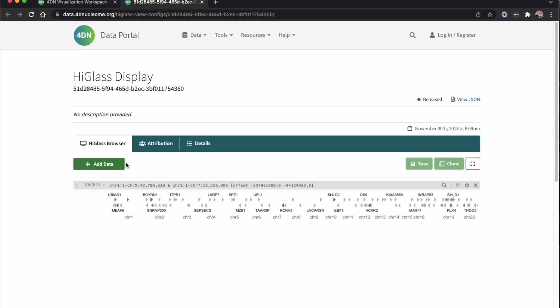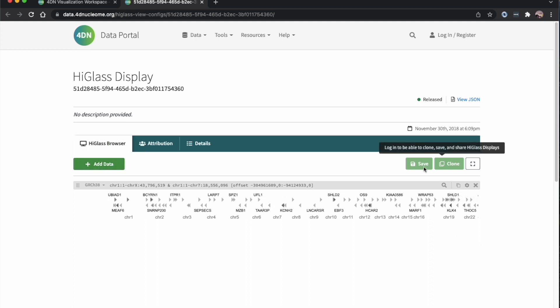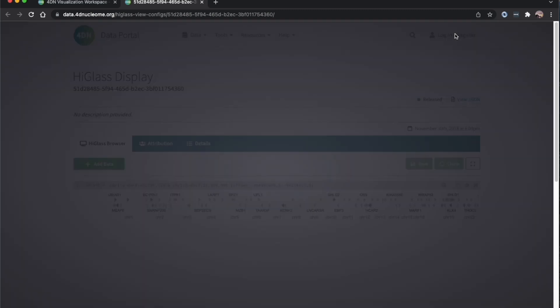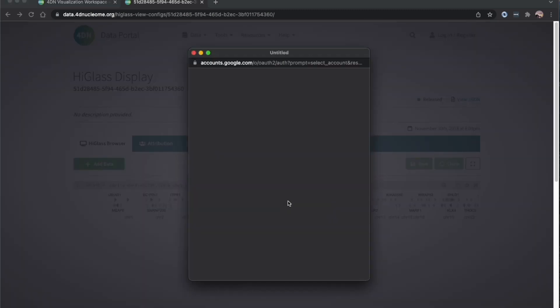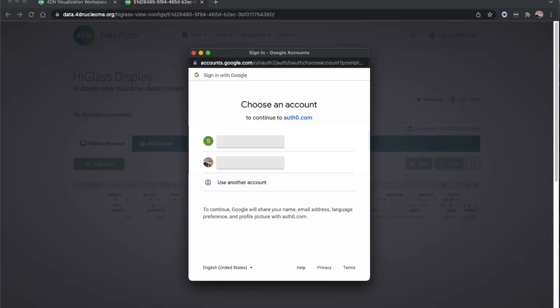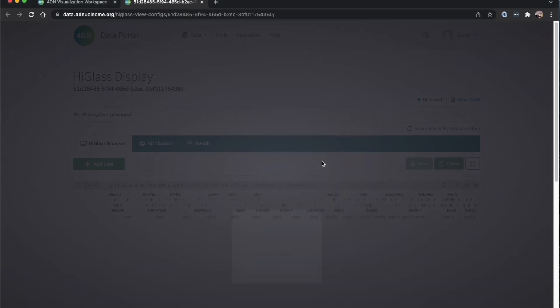If we're not logged in, we can still add data and look at things, but we won't be able to save anything. So I'm just going to log in quickly. If you're not a 4DN member, you can still register an account.